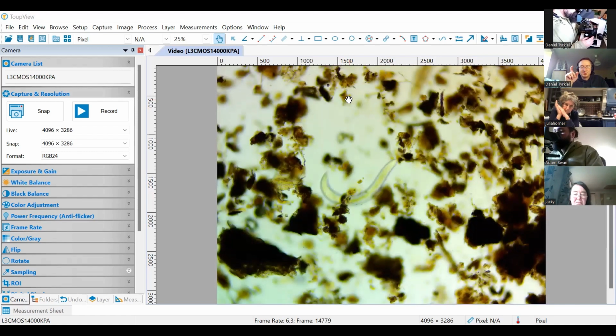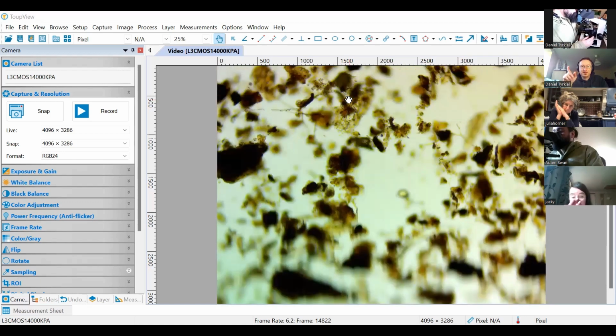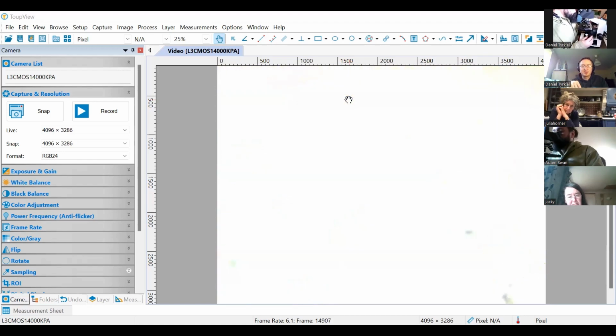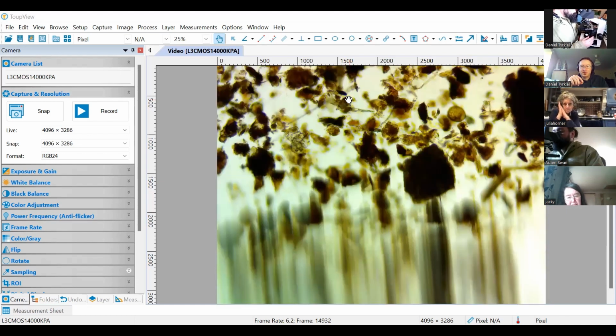There is also a compromise objective that you usually need to buy separately, the 65 times magnification objectives. They still work with the air gap, so you don't need oil, and it's already a higher magnification than 400 times, so if you really need more detail, you can. But again, we just don't use them. We've got one microscope with that objective.